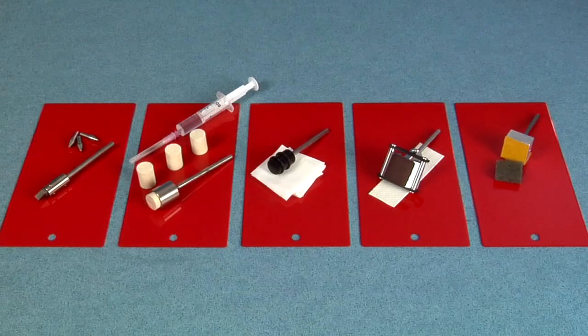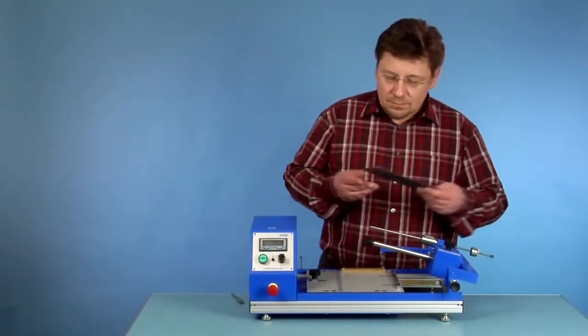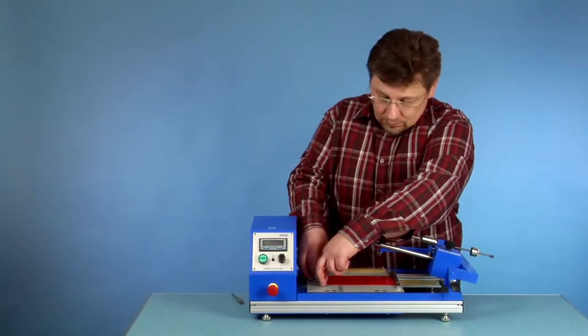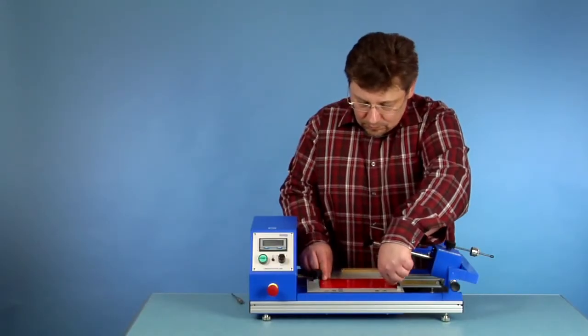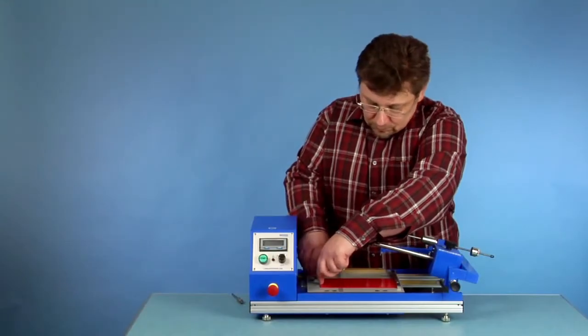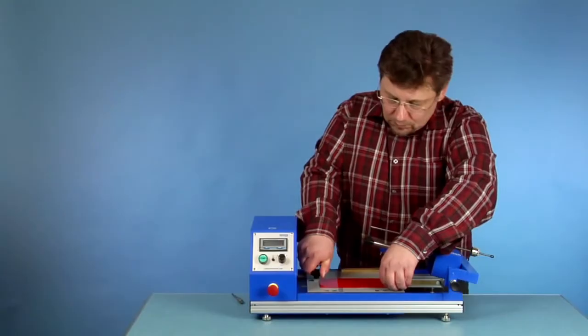Although there is a huge range of scratch tools available, the user can also fix and use their own individual ones. Several sizes of test samples can be fixed by simply clamping on the unit's sled. For single scratches, a single hub is adjustable. There are several test speeds selectable, preset as well as freely adjustable.